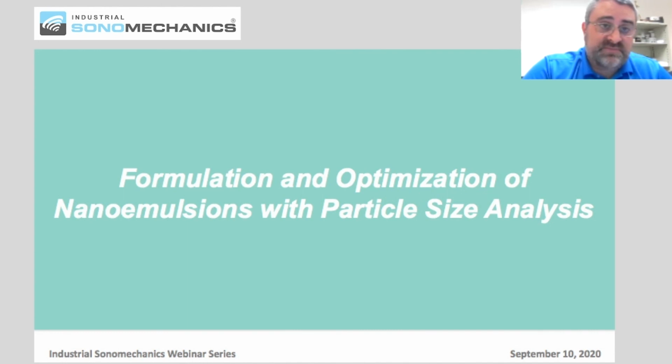So when we're looking at particle sizes that are less than 500 nanometers, we can use laser diffraction. However, Mie theory starts to not work so well because you're getting smaller than the wavelength of the light. And when you're getting smaller than the wavelength of the light, you're getting away from Mie scattering, and the particles are scattering light as Rayleigh scattering. And Rayleigh scattering is one of the operating principles of dynamic light scattering. You're assuming that the light is scattered in all directions equally by the particles. So there is going to be an overlap.